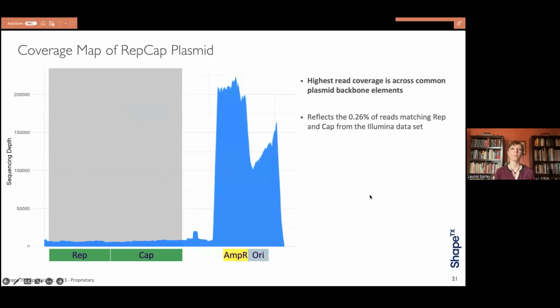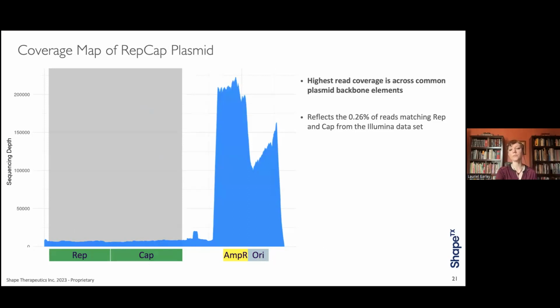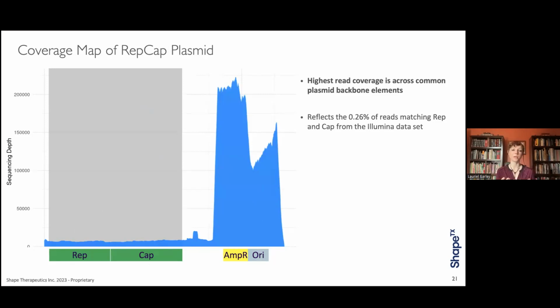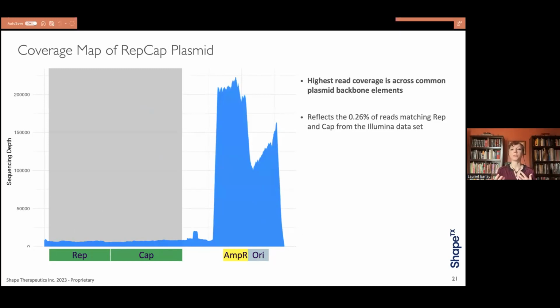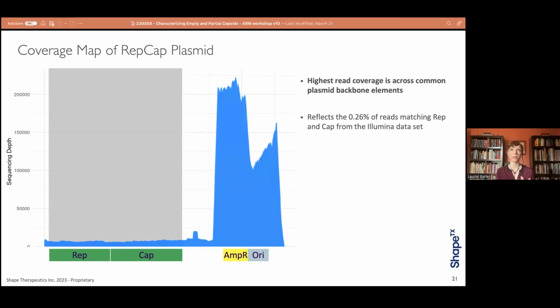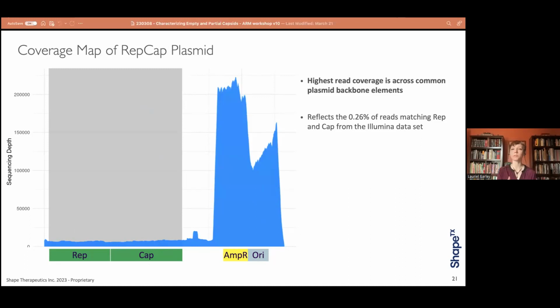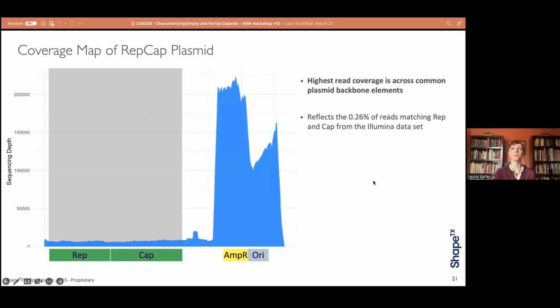When we look at our RepCap plasmid, we can see a pretty even coverage across here, a little peak at the P5, because this is a plasmid that has the P5 downstream. And then the ampicillin and ori are at higher coverage than the Rep and the Cap, which we would kind of expect because we already saw that plasmid backbone was a higher reference map count. And this may be because also that these ampicillin resistance and ORIs are very common across plasmid backbones. And so looking at this alone, you wouldn't know if it was coming from your RepCap plasmid or from your payload plasmid. And that's something that your long read sequencing could give you insight into.